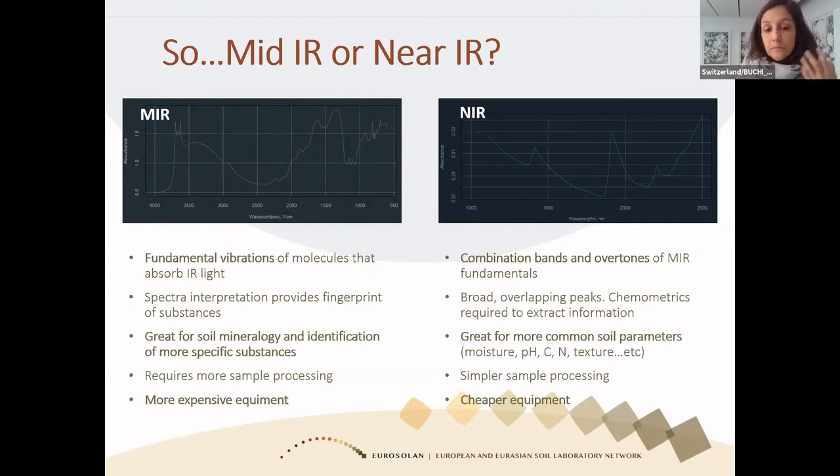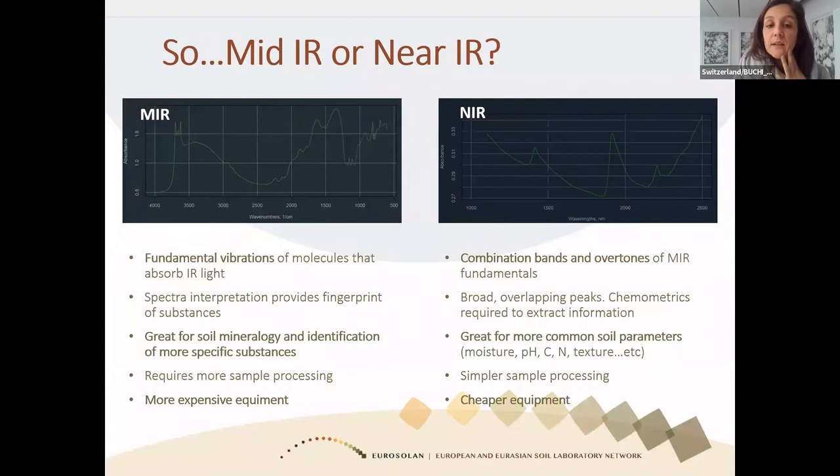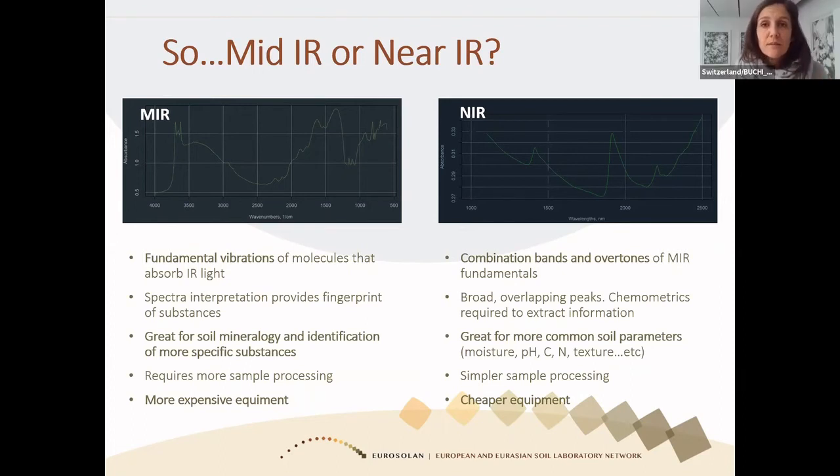So here come some of the perhaps more critical points. MIR usually requires more sample processing, whereas NIR is quite simple. Dry and sieve the sample to approximately 1 or 2 millimeters, and that's it. With MIR, it depends on your configuration. Some ways involve the preparation of KBr disks with a special device. This is quite time consuming. So there are more modern ways nowadays, which are faster.